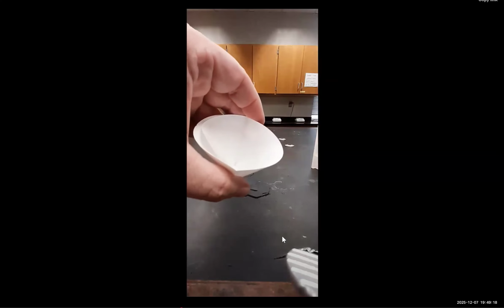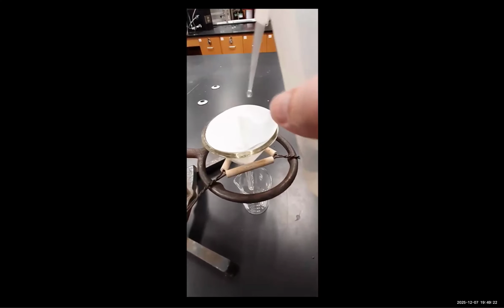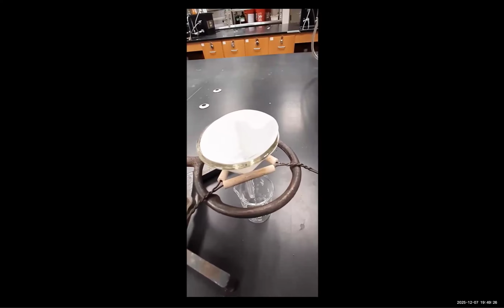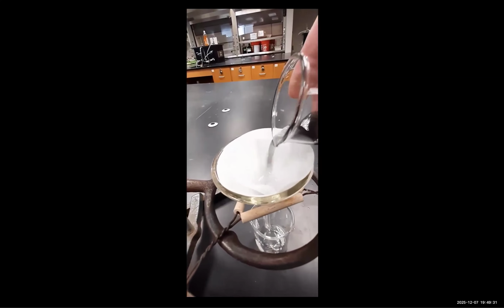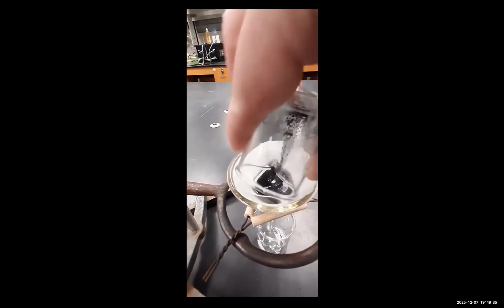So we prepared our piece of filter paper. Now we've set up our filter funnel. And now we're going to filter our mixture containing charcoal, chloride, glucose, and starch through the filter paper. And we're going to allow the filtration to proceed.